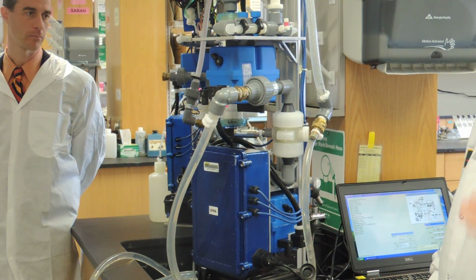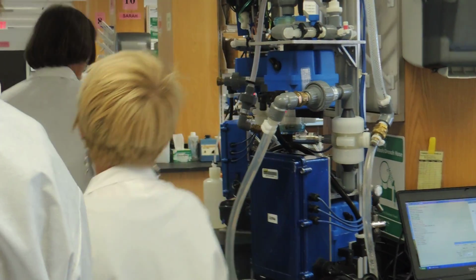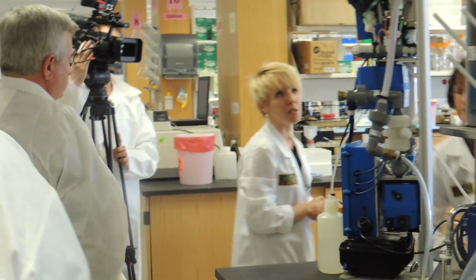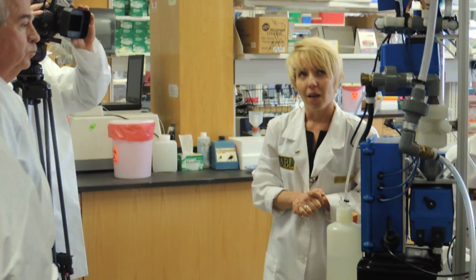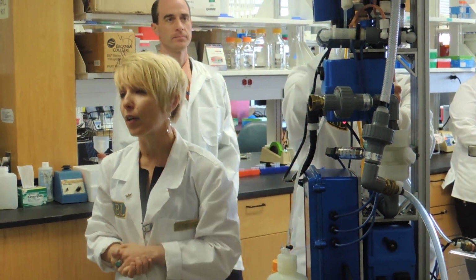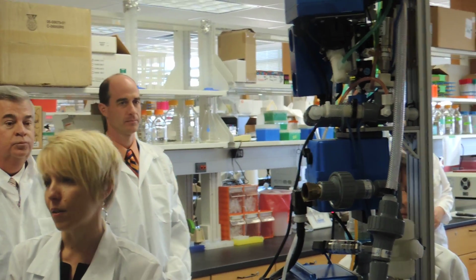So at that point, we will step over to our second unit here. And now we would have reattached the top portion of the unit, which contains the pump that will actually be utilized to flow the buffer into the filter that will be utilized to recover our concentrated sample.